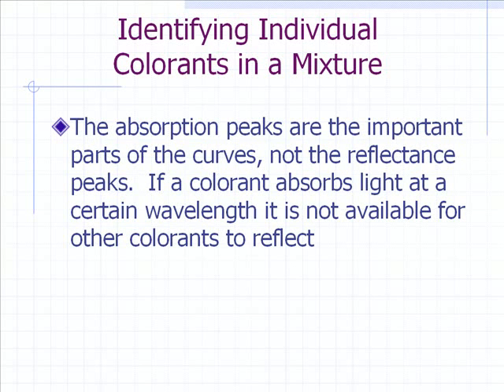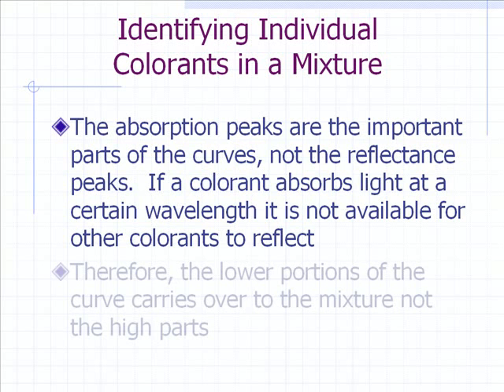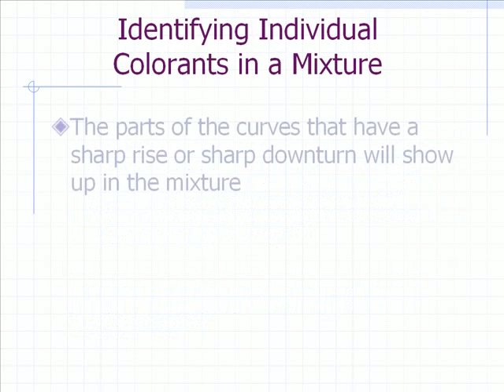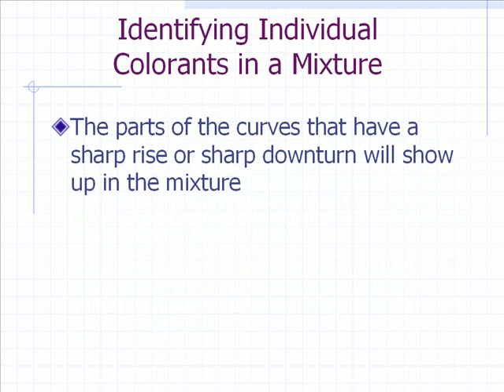So therefore, when you're looking at the curves, the lower portions of the curves carry over into the mixtures, not the high parts. Now, the parts of the curves that have a sharp rise or a sharp downturn will show up in the mixture. The wavelength where the inflection point of the curve is important and will also show up in the mixture. So any part where it goes up real fast or comes down fast generally gets transferred into the curve for the mixture.